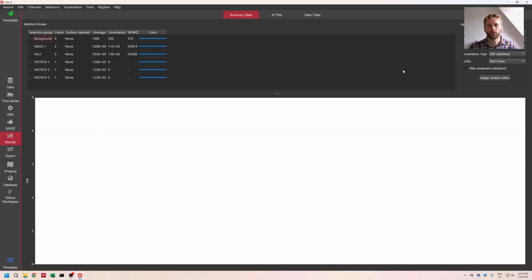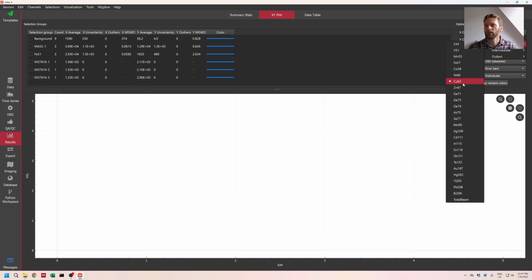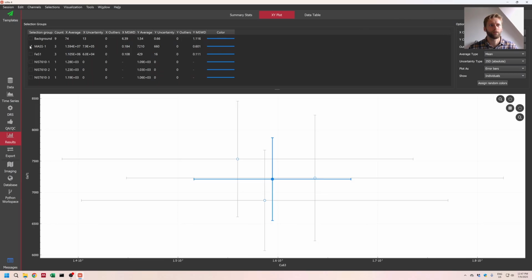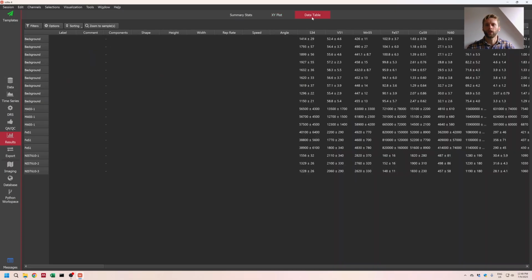Okay, we can go to results. I don't use results very much. I think it's so that people can kind of play around with their data a little bit. What's going on here? Maybe you have to, okay. So, yeah, I don't use this very much. I guess this is just a way to get some quick plots of the data. But I hardly ever use this because I just export the data and look at it on my own computer using other programs. One nice thing about this is you can go to the data table though.